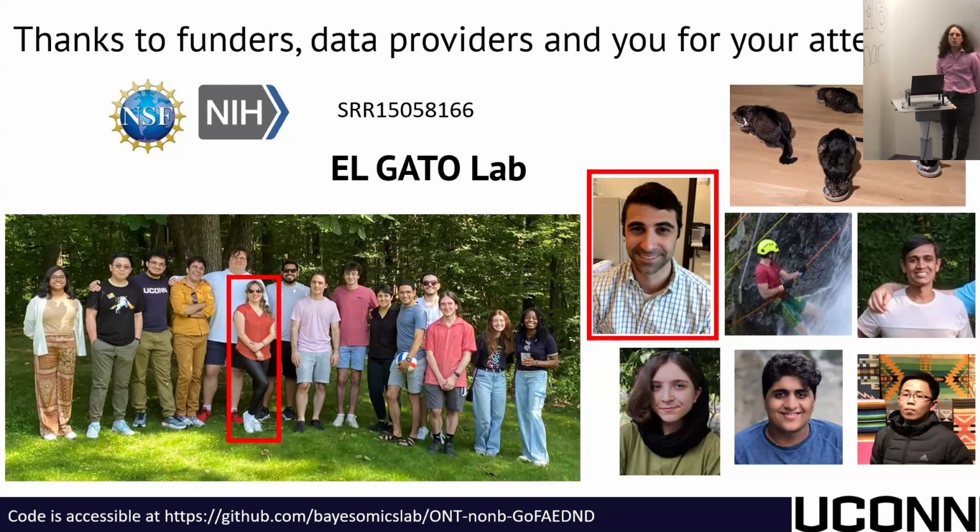It's really hard. One of the things that I glossed over is all the work that Marjan did, the technical, boring software engineering work. We need raw nanopore sequencing. We can't work with BAMs. We can't even work with Fast5s if they don't include the information on the current. So even if you have raw nanopore, it doesn't mean we can apply this. It was a pain. Genome in a Bottle was really a godsend because that was the only thing I could find. There are a couple of others that we're trying to use now, and we're working with the T2T consortium folks to do similar things in the T2T genome.